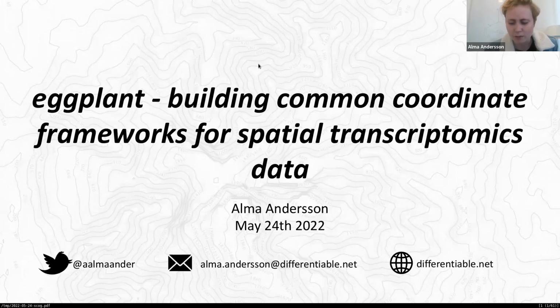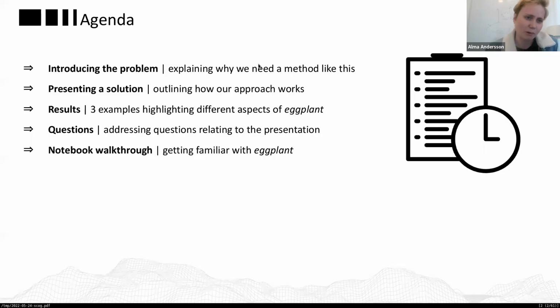Before we get started with that, though, I just wanted to give you an outline of the agenda, or my idea for this session that I'm supposed to host here. I wanted to start with just introducing the problem, trying to explain why we need a method like this and what's relevant about it, and the problem that we're trying to address, to then present a solution to this problem and outlining how our approach works, that being Eggplant, to then show you some results, giving you 3 examples that highlight different aspects of Eggplant and the type of analysis that you can make with it.